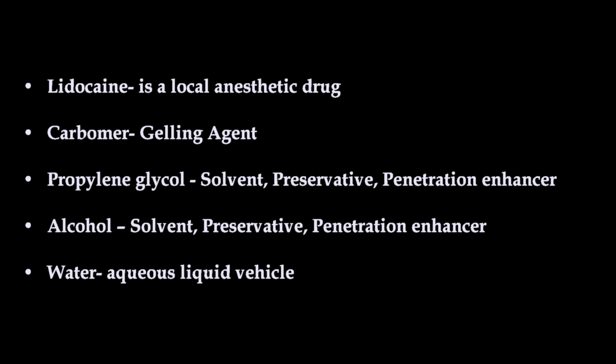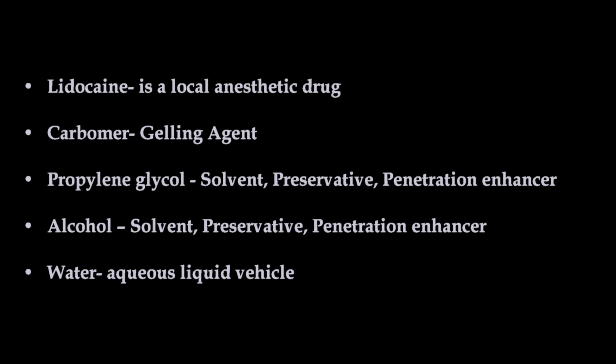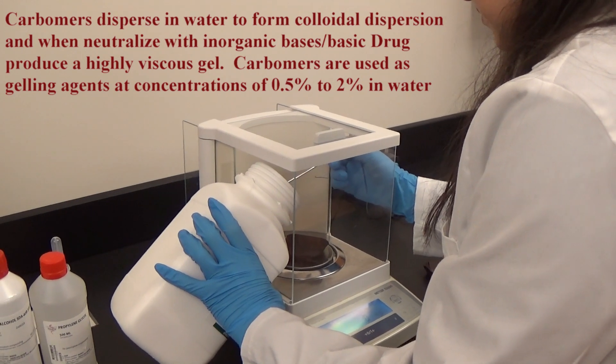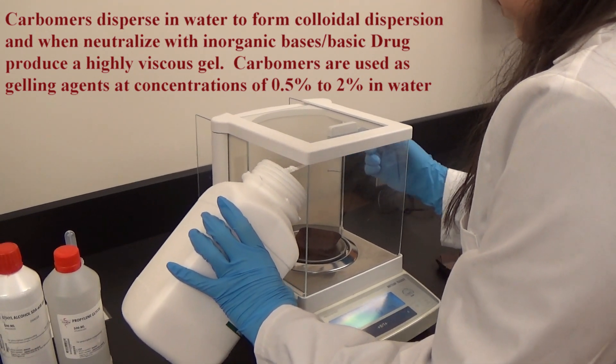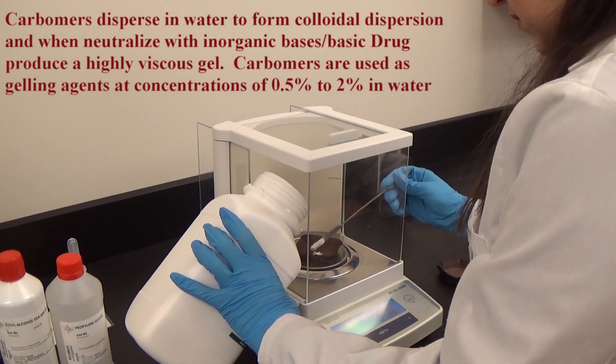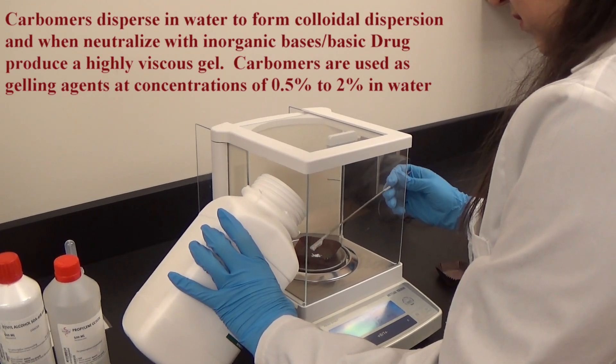Before we get started, we'll need to calculate the amount of each ingredient required to fulfill the prescription. First, we'll weigh the carbomer 940 into a weighing boat and keep it aside.